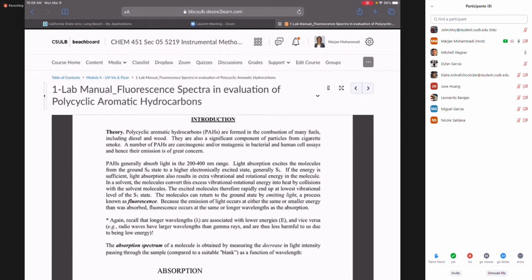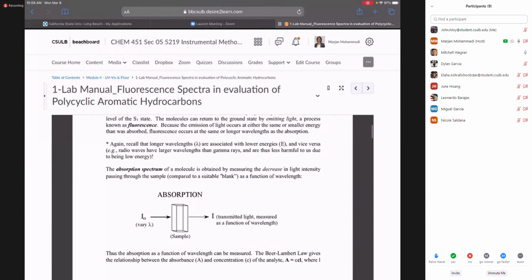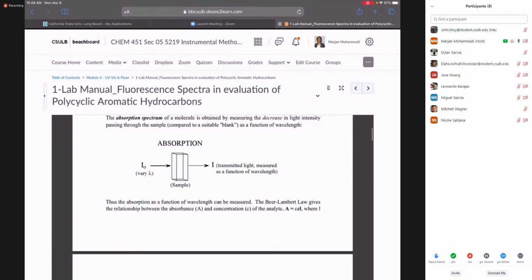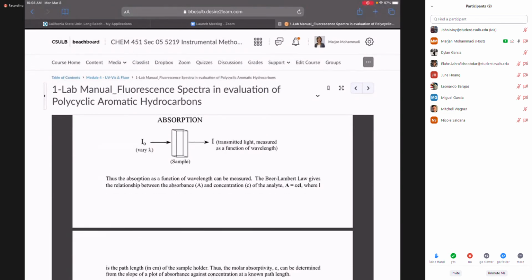But basically, the first part of this experiment is going to be UV-Vis. As you may see in the video, we are going to make a couple of solutions with a different range of concentrations. And then you all, I'm sure, have seen the UV-Vis. We are going to fill the regular glass cell with the sample, and have one blank. Then we are going to run the UV-Vis. The range was from 200 to 600. We are collecting the peaks, as you are going to have in the mock data.